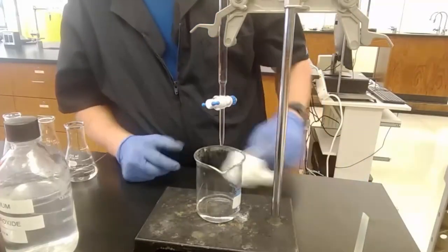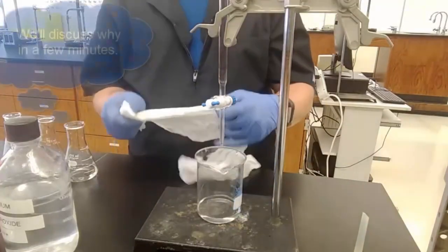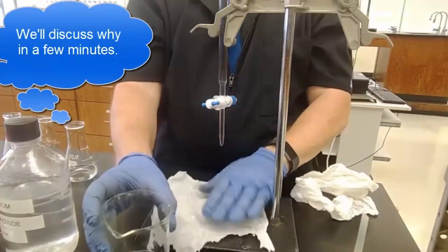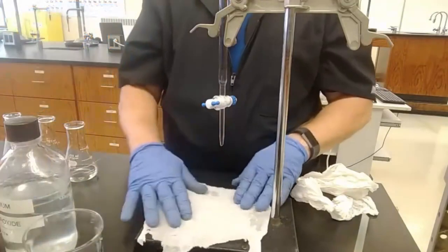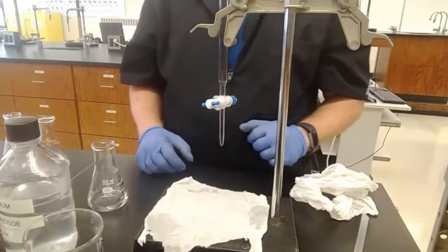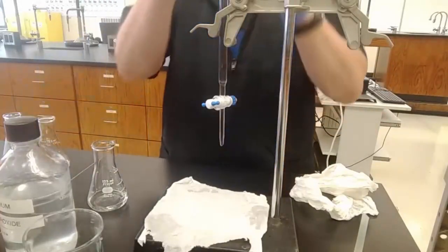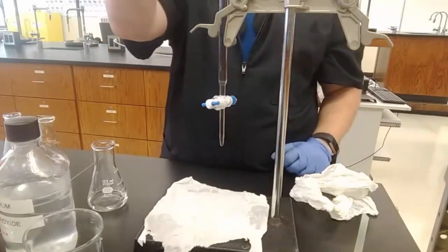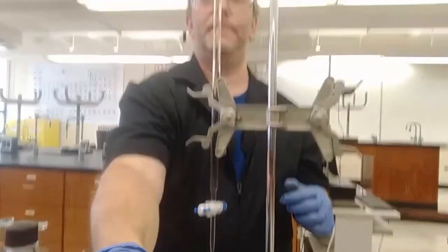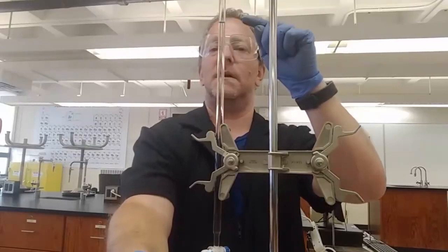So I'm going to put a white piece of paper underneath the flask when I go to start my reaction. Just got a paper towel here. Okay, waste beaker is there. Now, I need to get a good starting reading of my volume. So I need to look really carefully, maybe get a piece of paper with a line on it behind my burette, get my eye level right at the liquid, which is right here. You can even see it on the camera.